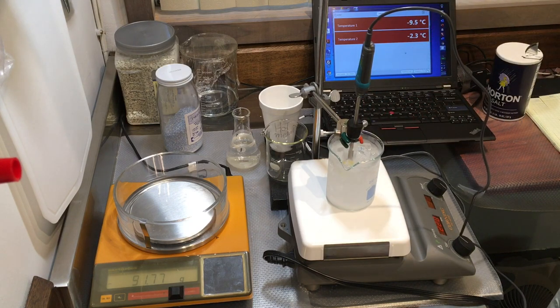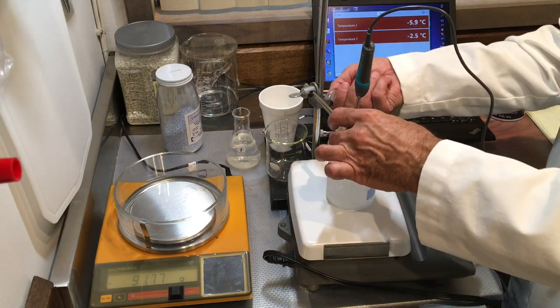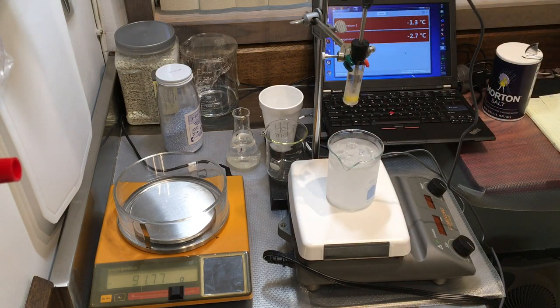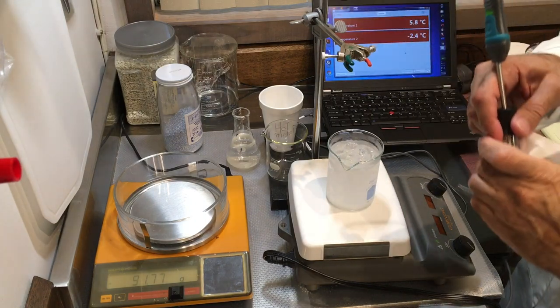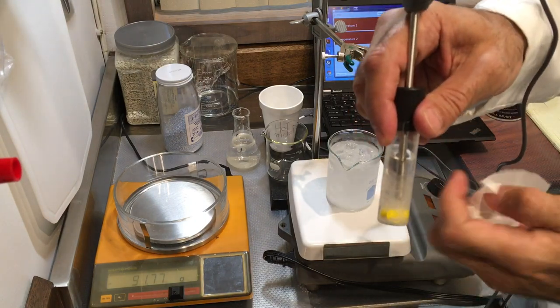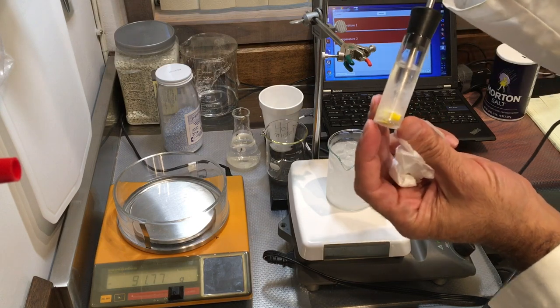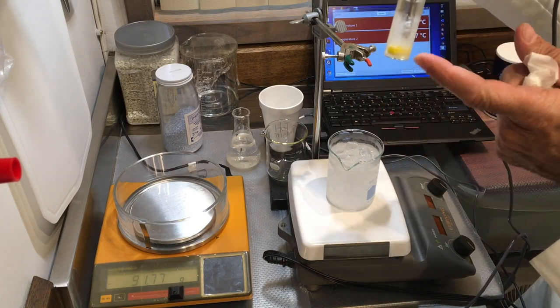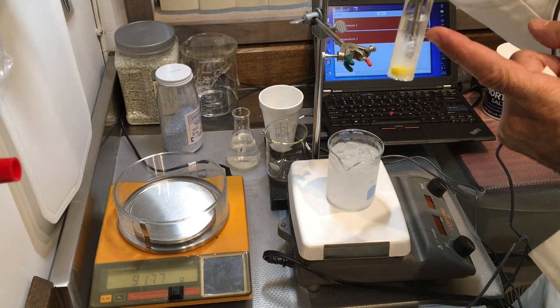I'm going to stop the experiment here — you've seen enough of the data. Let's turn off the stirrer. You can see this is the frozen piece. I'll start to warm it to remove it. This part is all frozen; there's a portion starting to melt from the top with the stuck stirrer at the bottom. The ice started forming from the bottom, stopped the stirrer, and then grew upward.